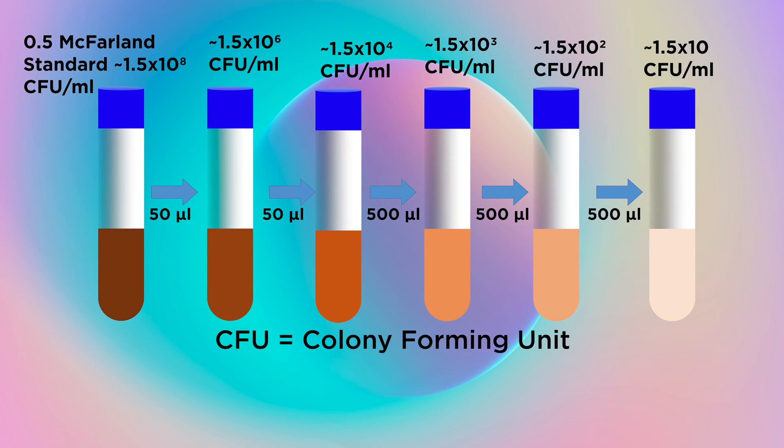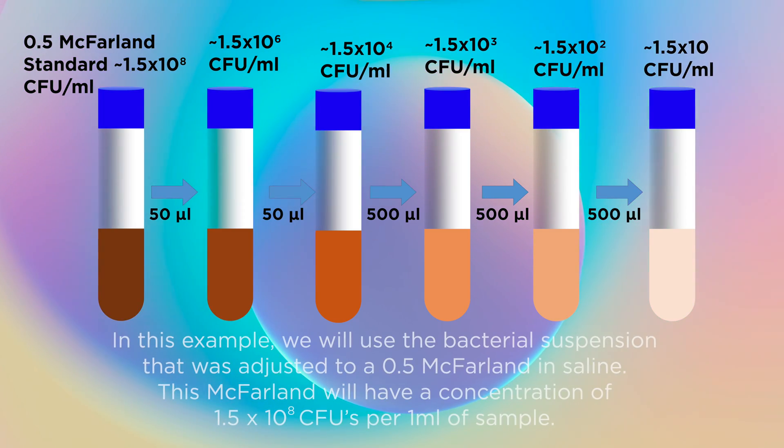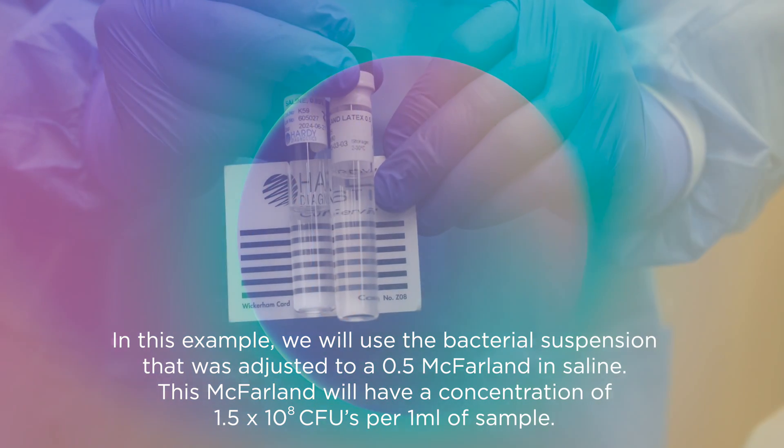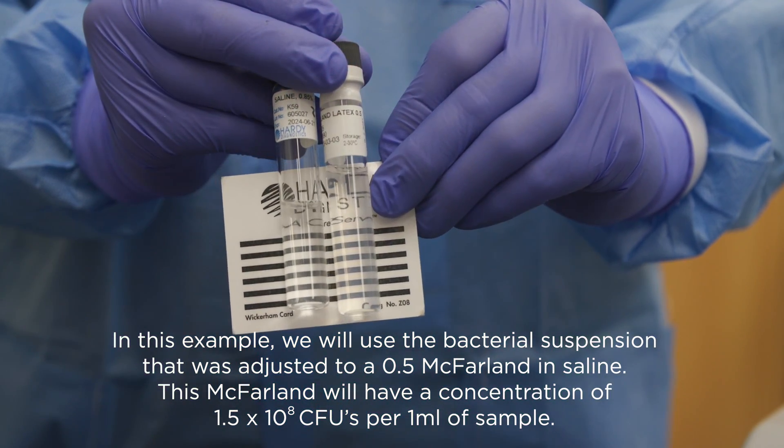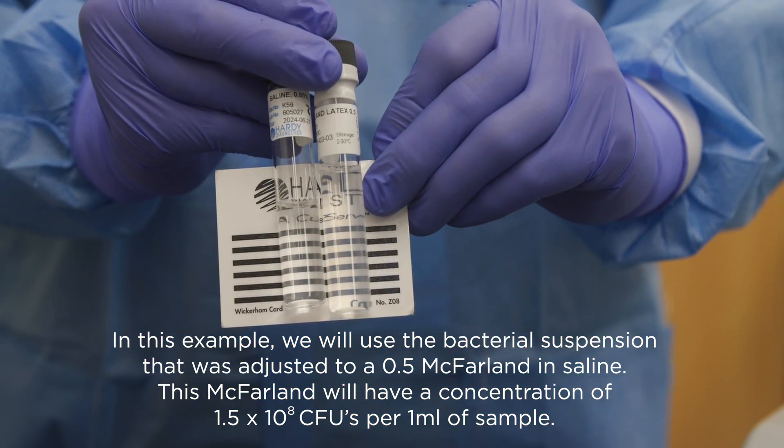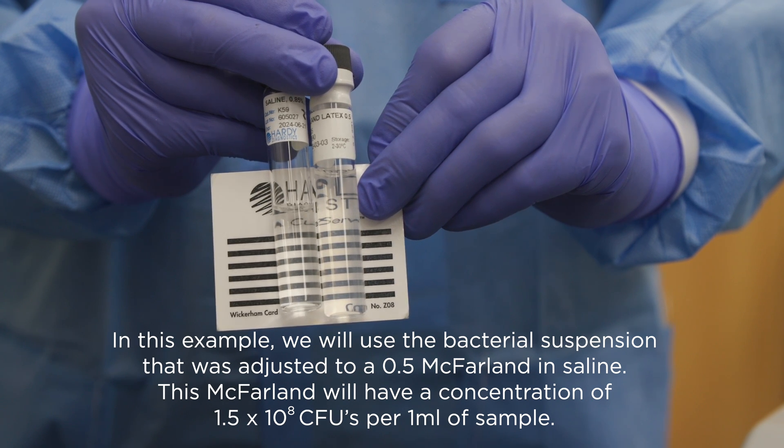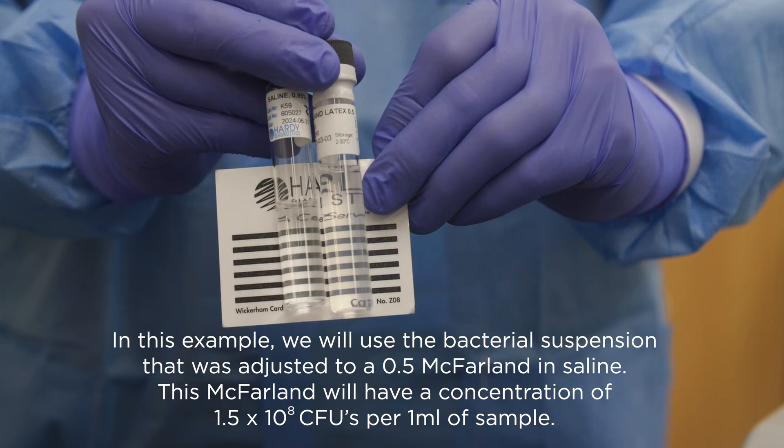Standardized bacterial suspensions can be diluted in order to obtain an approximate final concentration of the organism. In this example, we will use the bacterial suspension that was adjusted to a 0.5 McFarland in saline. This McFarland will have a concentration of 1.5 times 10 to the 8 CFUs per 1 milliliter of sample.